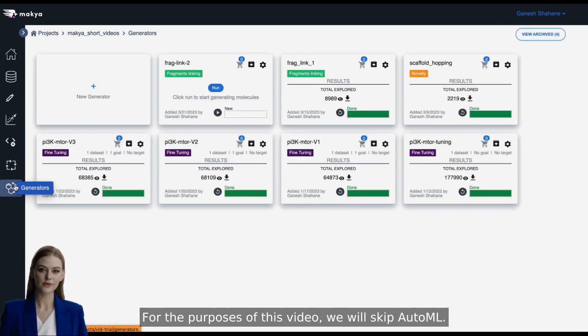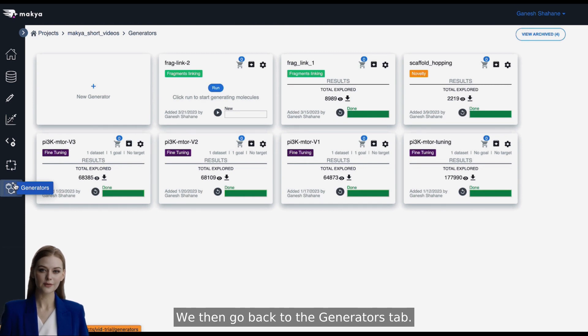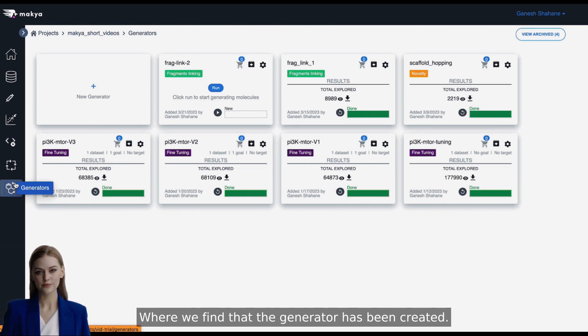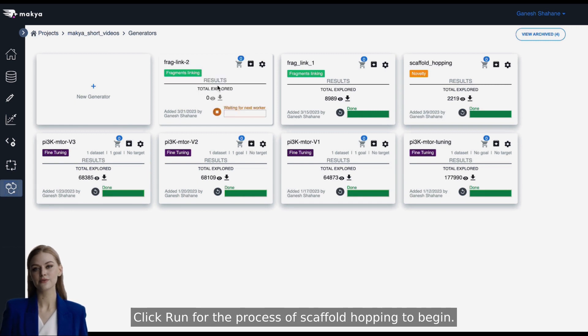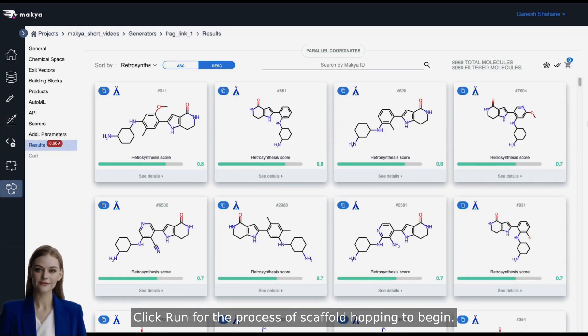We then go back to the Generators tab, where we find that the generator has been created. Click Run for the process of scaffold hopping to begin.